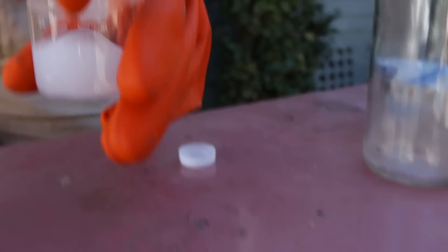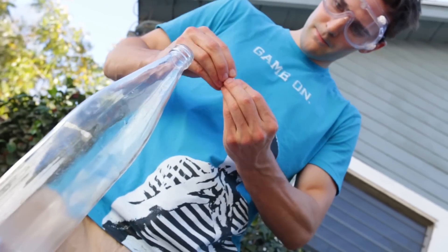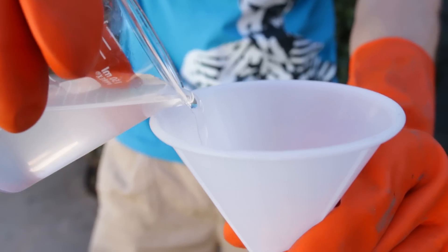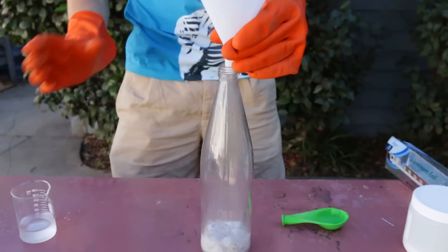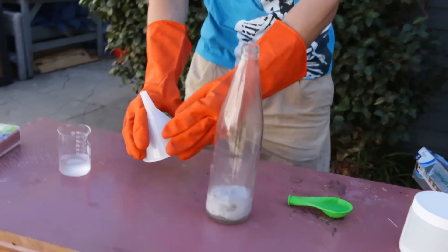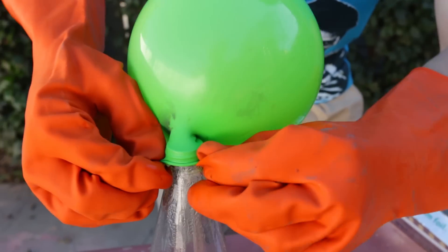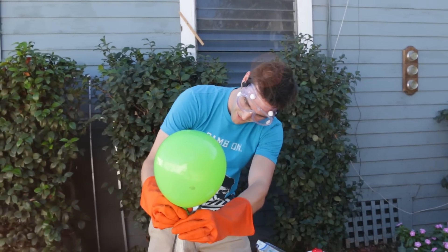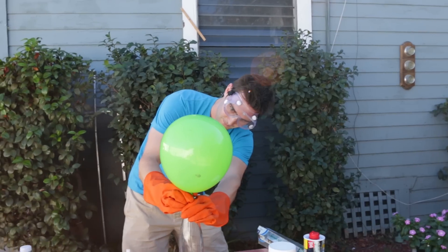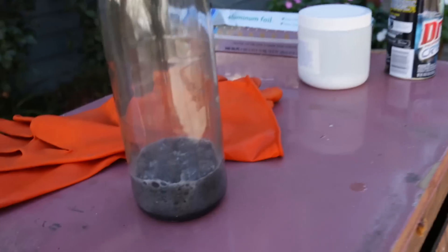If you touch this it's really warm. We got this aluminum foil from the regular grocery store. Oh, that bottle's hot! That balloon is hot — hot, hot, hot — I can barely touch the top of it.